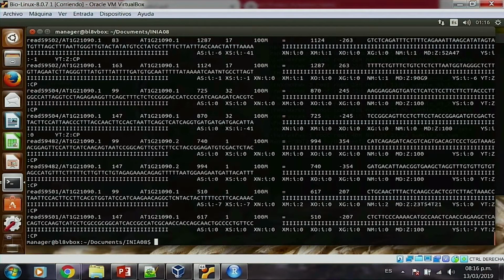It doesn't make sense at all? So remember, we have one line per read. And that line describes where this read was aligned. So this line here, that starts here and finishes here, is telling me that this read aligned to this sequence in the reference, which is a gene. From this position, it had 17 of mapping quality, 100 matches, and then additional information about the sequence. But what I want to know is that this is the sequence it was mapped to.